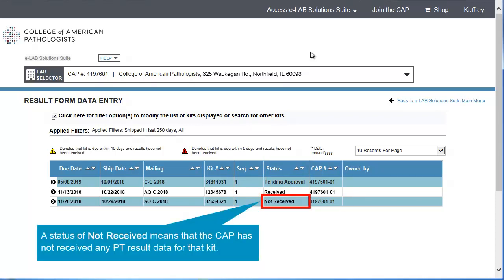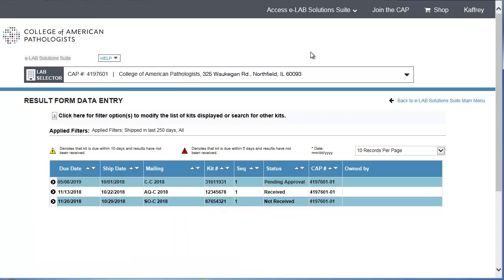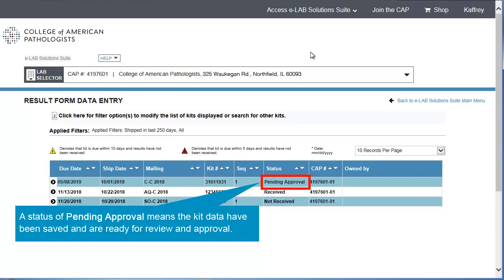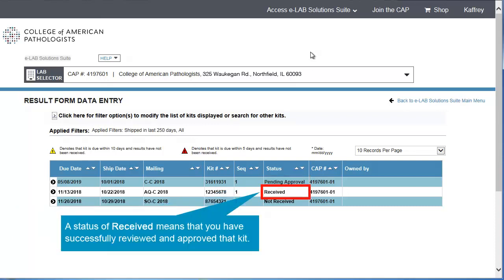A status of Not Received means that the CAP has not received any PT result data for that kit. A status of Pending Approval means the kit data have been saved and are ready for review and approval. A status of Received means that you have successfully reviewed and approved that kit.